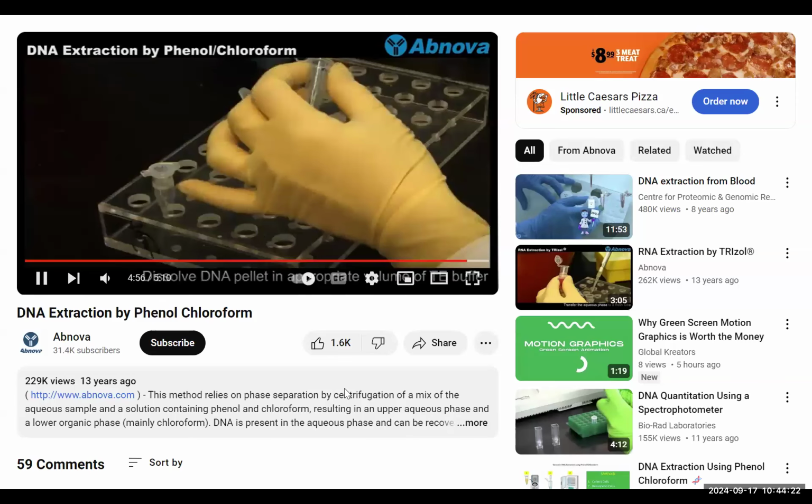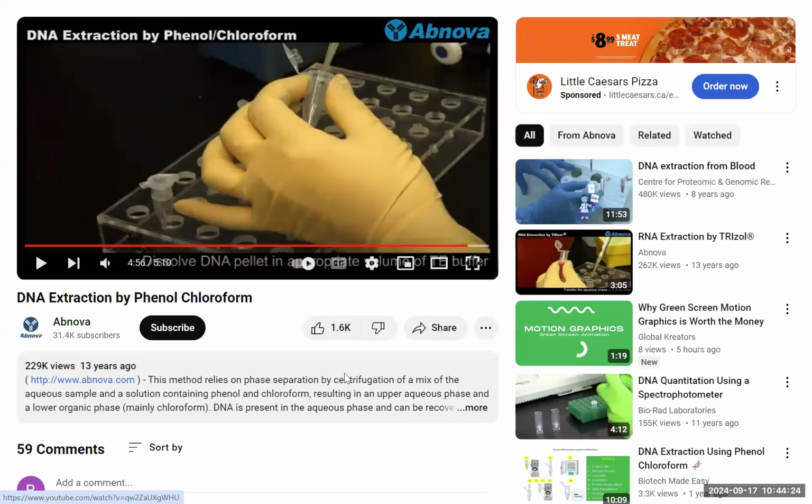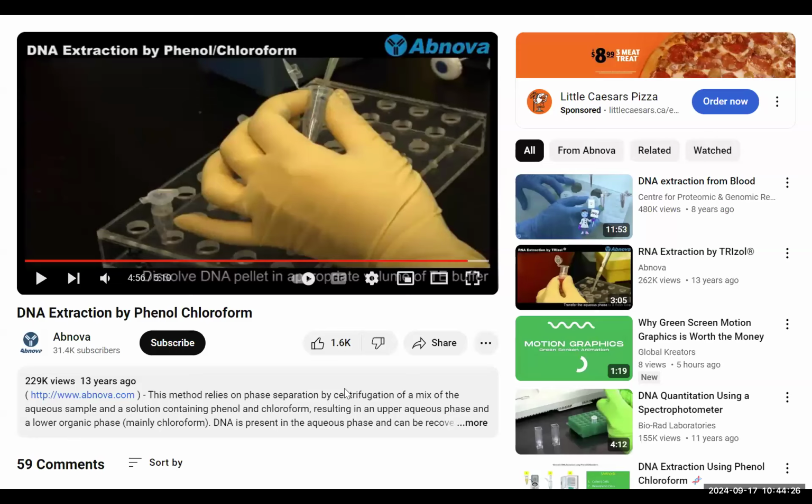Okay, so let me answer the questions you have. A buffer and detergent can be used interchangeably, right? The buffer contains detergents. A buffer must have some sort of detergent like SDS or Tween 20 or stuff like that. Would a non-ionic detergent be the preferred source here to prevent denaturing of nucleic acid?